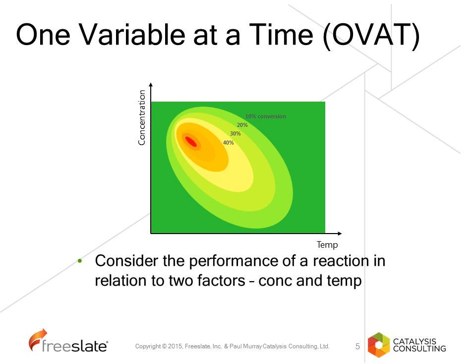So what we have here is a reaction space, and we have 2 parameters of concentration and temperature, both of which, if we change them, we expect to have an outcome on the reaction. We have no information about this reaction, but we want to try and get this reaction to work, and it is possible to do this.